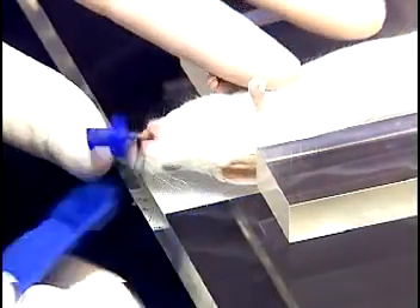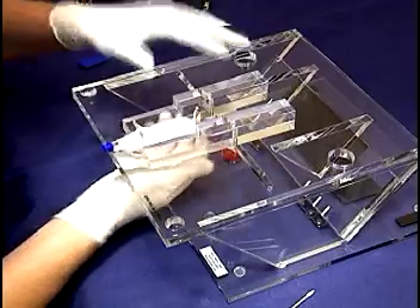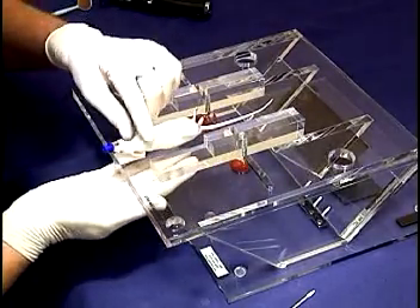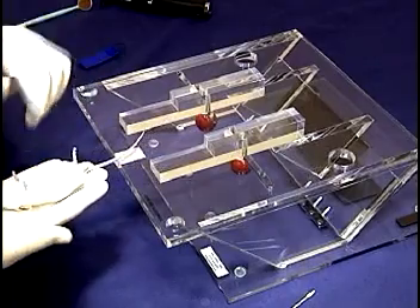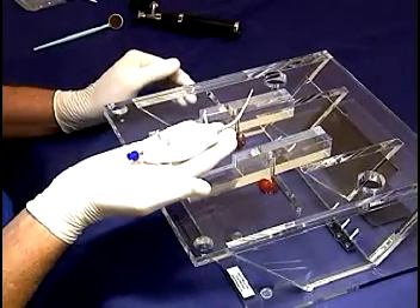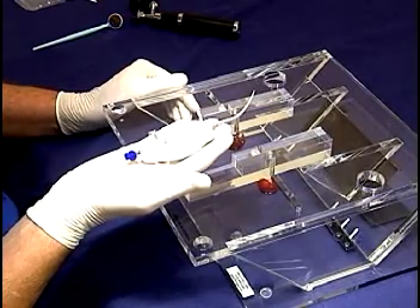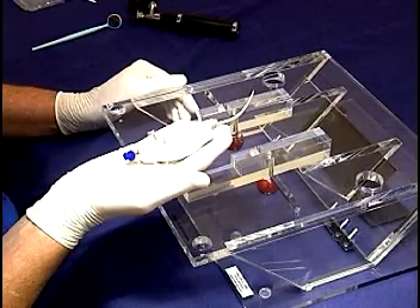Finally, the incisor loop is removed, the body positioner is loosened, and the mouse is gently removed from the stand. The trachea of the mouse is quite short, and the tube is not inserted very far. Considerable care must be taken when removing the intubated mouse and connecting it to the breathing circuit.